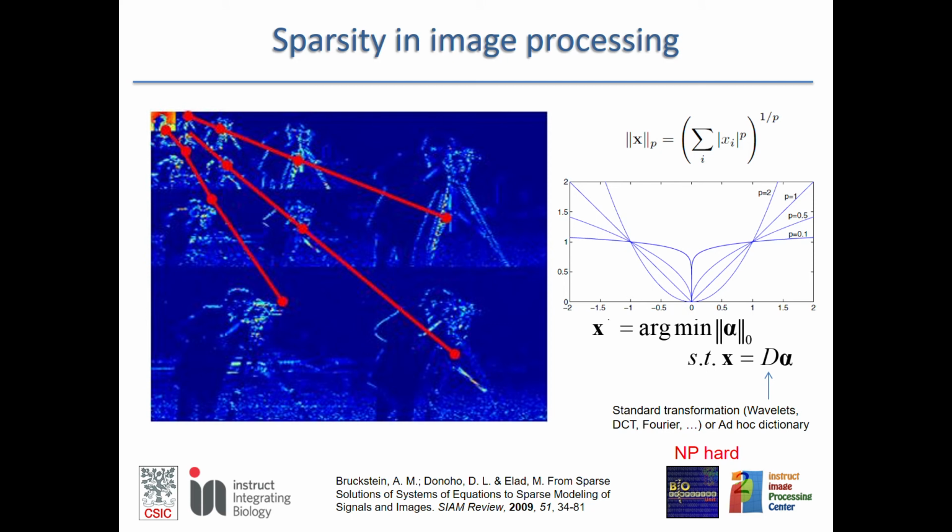The idea is that you take very few wavelet coefficients to make your volume. And here we have a representation of that. Let's say this is the famous cameraman image. If you do the wavelet transform, you see that the energy is concentrated at very few locations. Most of the coefficients are almost zero, and just a few of them have energy.